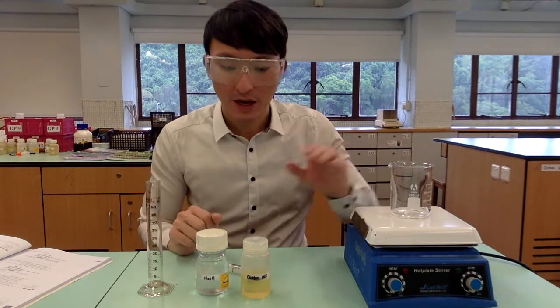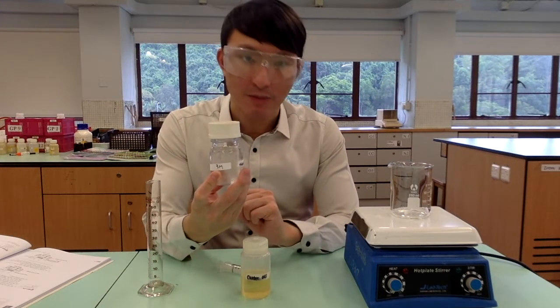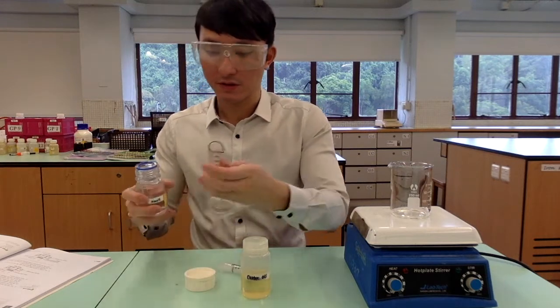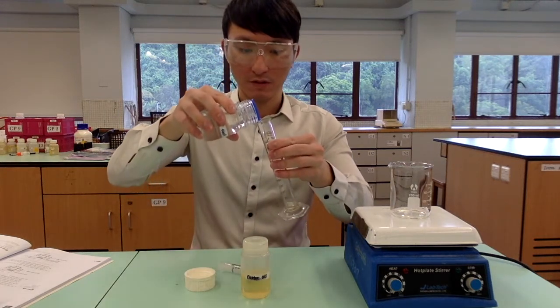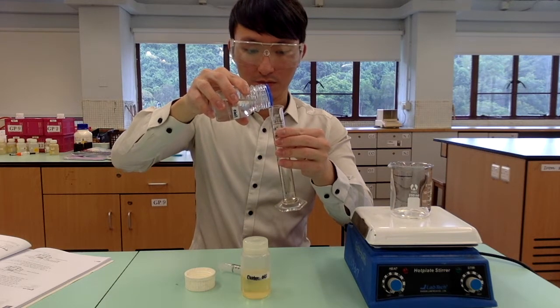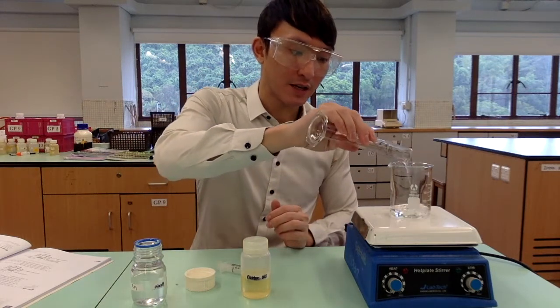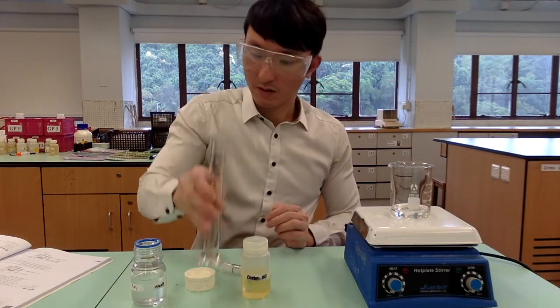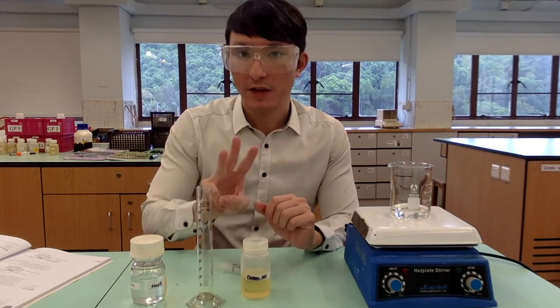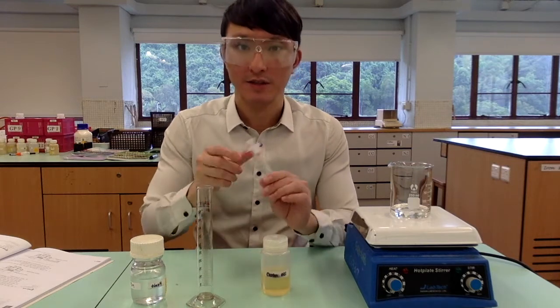Now, to the beaker, we are going to measure 30 cm cube of 3M sodium hydroxide using a measuring cylinder. Transfer the sodium hydroxide into the beaker. To that, we are going to transfer 3 ml of castor oil into the sodium hydroxide using a syringe.